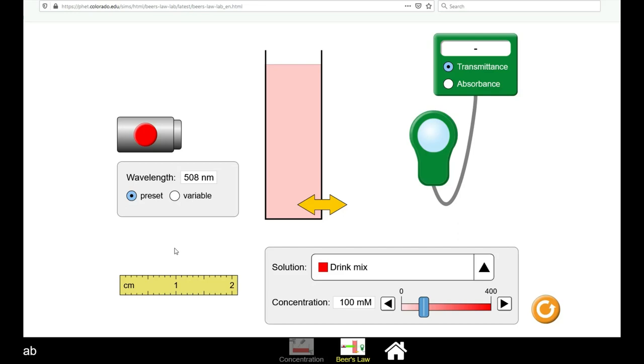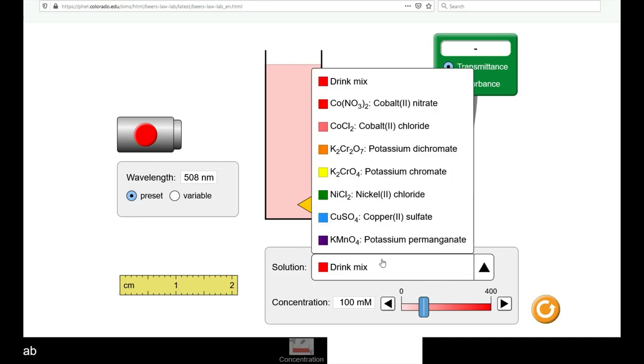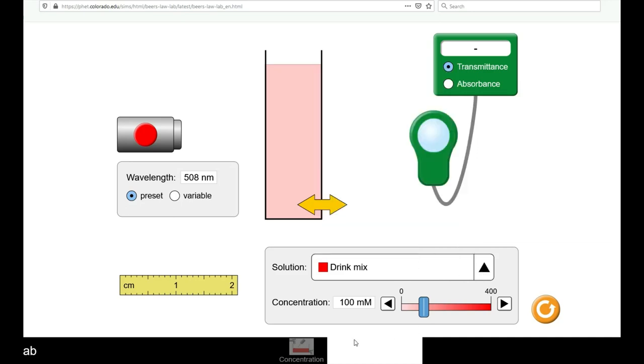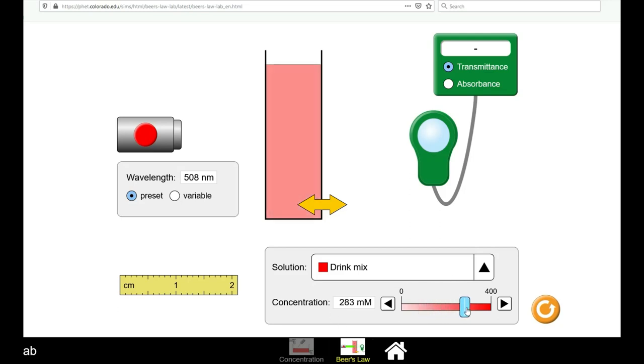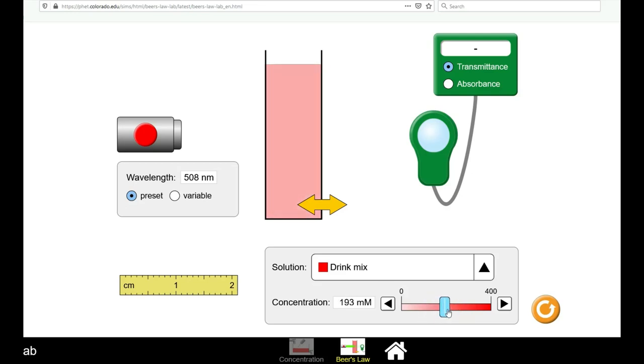In the simulation, you can choose differing types of compounds to look at the absorbance and transmittance. You can also vary the concentration of these compounds and notice the intensity of the solution in the container.